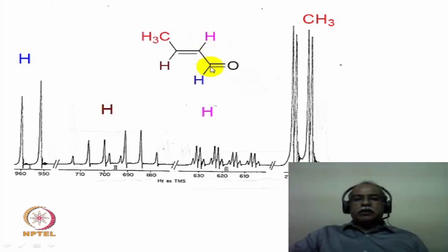So it undergoes a spin-spin interaction with the magenta hydrogen, and as a result of that, a doublet multiplicity is what is seen here. Now if you take the alpha hydrogen and the beta hydrogen, namely the magenta hydrogen and the brown hydrogen, because of the electron-withdrawing nature of the carbonyl functional group and the resonance associated with the double bond being conjugated with the carbonyl functional group, this would be an electron-deficient carbon.